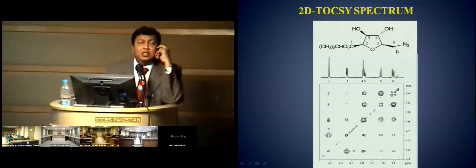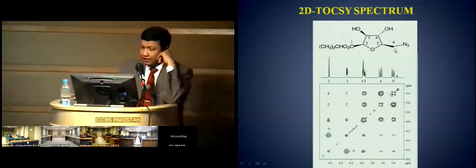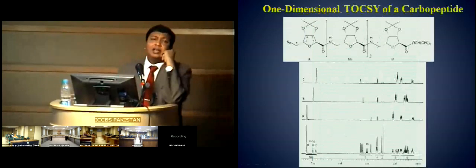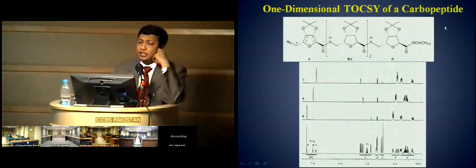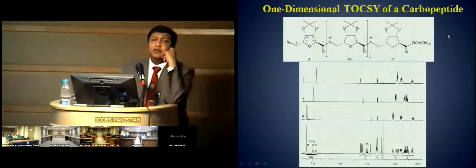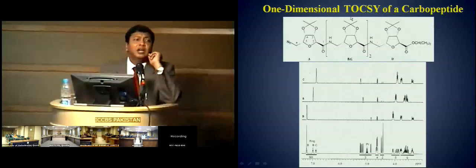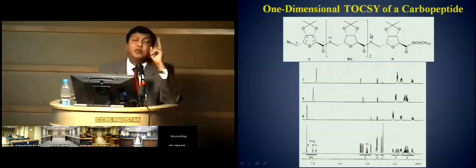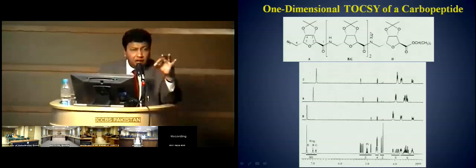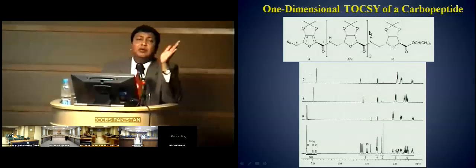within the spin system. And this beautiful, amazingly powerful, robust technique is now handy to every person for structural elucidation, because you may have 30, 40, 60, 70 different spin systems in your molecule, and you would be able to record a separate NMR spectrum of each spin system theoretically. So it is an amazingly powerful technique.